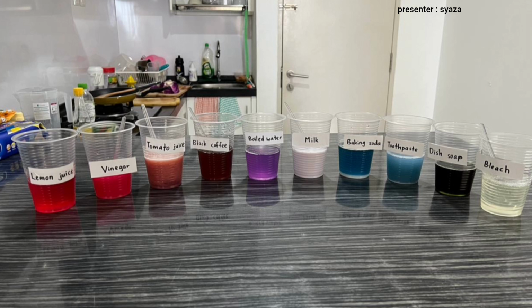Lastly, when the strongest alkaline substance tested, which is bleach, is mixed with the red cabbage indicator, the red cabbage indicator will change its color into a greenish yellow color, indicating that it is alkali. Unlike other substances tested like baking soda will have a closer color to a lighter shade of dark blue as the alkaline pH value is not really as high as the bleach that was tested. This is because baking soda is considered a weak alkali.